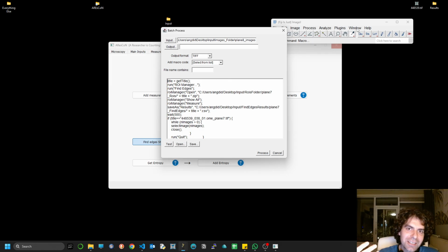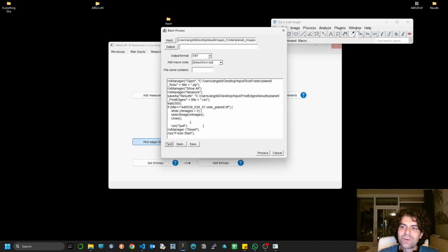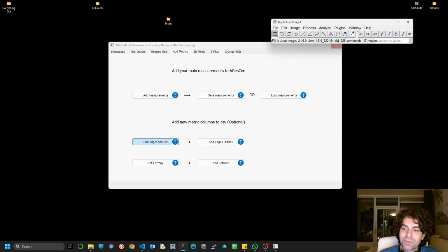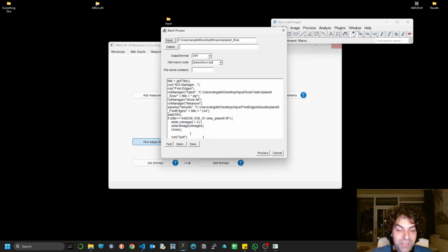Your intervention is needed for something to go wrong. But in case something goes wrong and you see that the whole code has stacked on Fiji because Fiji took more time to open than usually, for instance, something happened to your PC, and within the first 15 seconds, that is the leeway of the Control L to be pressed here and macro to be typed is passed.